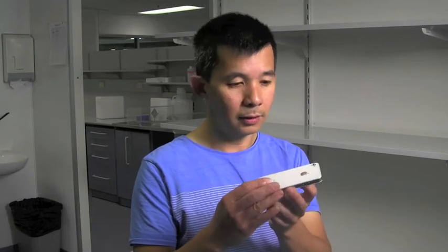With this lens on the camera of the mobile phone, you can now take photos at 160 times magnification. To turn this into an actual microscope, we need to provide illumination, and the lens holder does this with two miniature LED lights. This transforms the mobile phone into a high quality digital microscope of the same quality as you would expect to be used by pathologists in the laboratory.